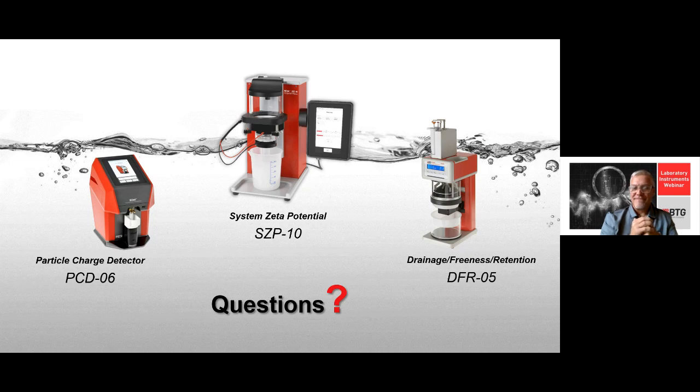Okay, thank you, Todd. I would say, Manfred, you touched it already, but maybe you can give one more precise answer: how to clean the equipment if there is scale on the bottom of the PCD tester. There, if the acetone cleaning solution that we spoke about before cannot dissolve the scaling that you see on the bottom of the PCD measuring cell, then the good news is the material is PTFE and the electrodes are made of platinum iridium.